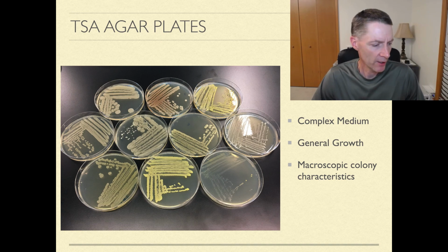Okay, guys, so we're working our way forward in laboratory now into Module 2. Up to this point, we've been looking at a lot of these kinds of plates, these clear plates. These are complex media, and we've been using these plates to look at macroscopic colony characteristics. So we're looking at color, odor, and so on, stuff that was in the quiz that you took earlier this week.